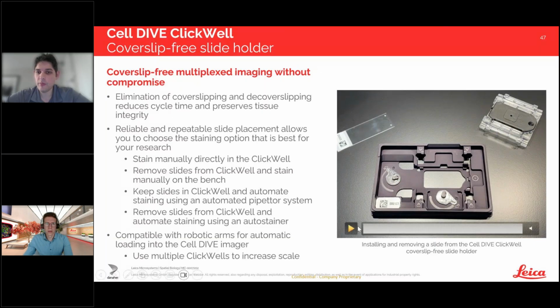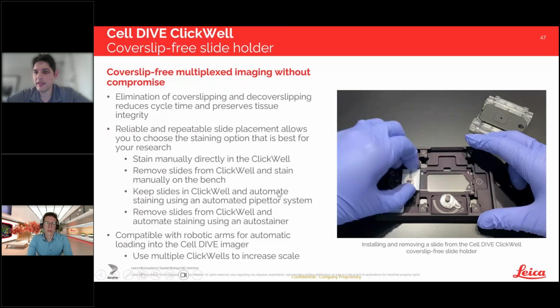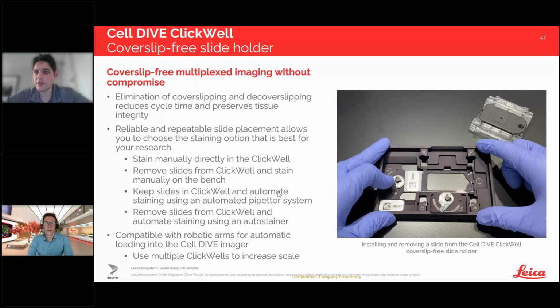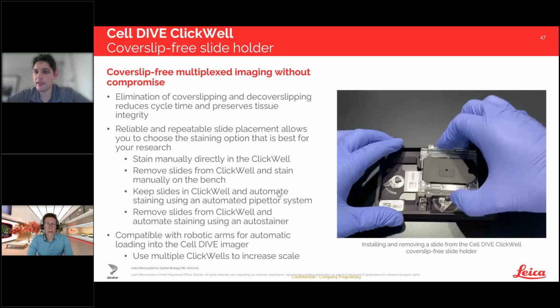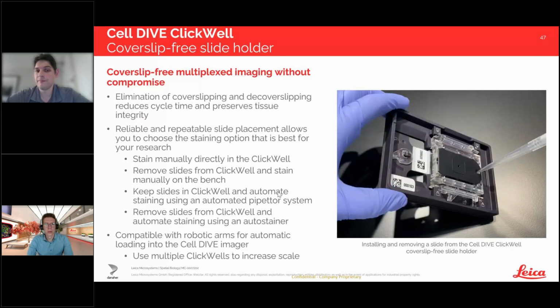And I'll just play the video one more time so you can appreciate how this works. The user here inserts the slide into the Clickwell base and tightens it into place using these adjustable cams. Then takes the Clickwell insert and clicks it into place, and that will form the reservoir, allowing them to add staining and wash solutions.